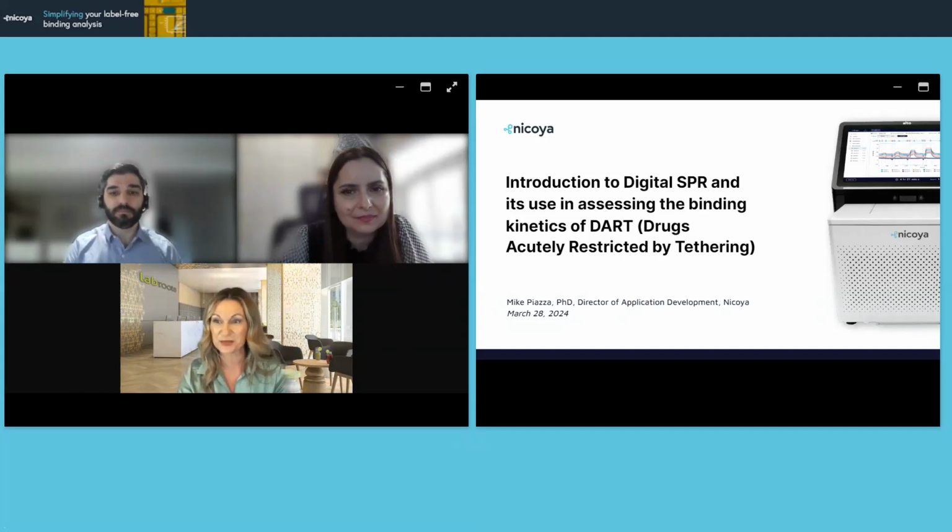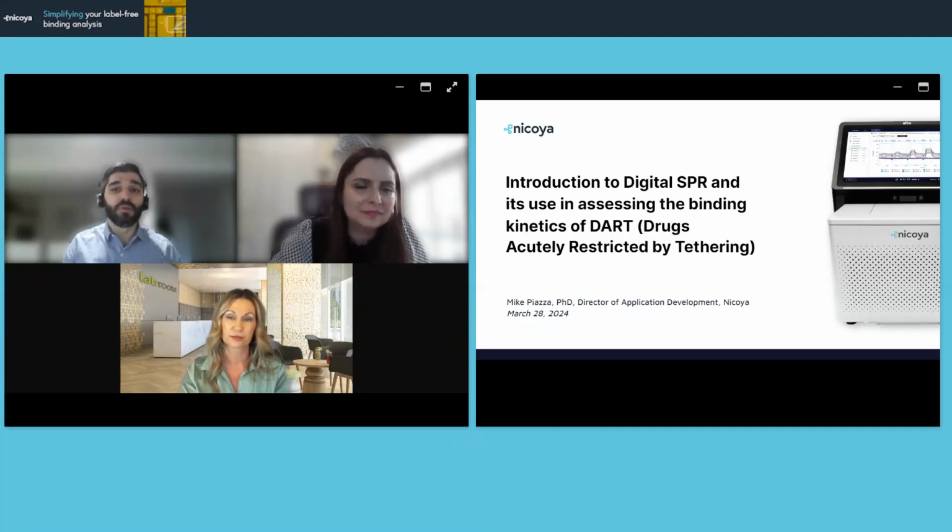Thank you. Next question. Are there limitations on sample viscosity? How about ionic strength, either very high or very low ionic strength? Good question. There are limitations on the surface tension of the samples that we load. If the surface tension is too low, or also drastically high, too low would result in a failed dispense.